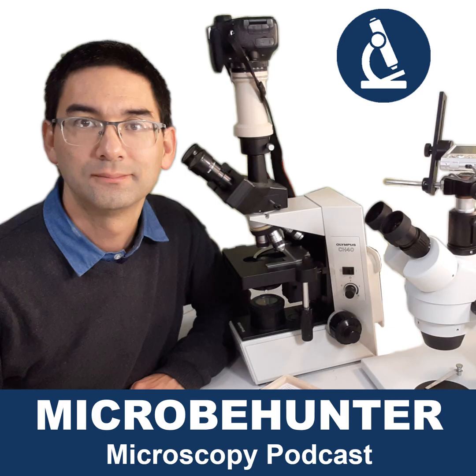And that's actually one of the problems that especially beginners have with microscopy. Many of them think that the more you magnify, or the more the microscope is able to magnify, the more they're able to see. But that's actually not the case. Just because you make an object appear larger does not mean that you're able to see more details. So that is the most commonly talked about limit, and that is the resolution limit. But that is only one of three points, and there are two more points that I would like to talk about.